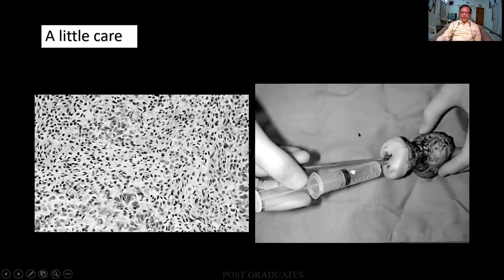Again, a wonderful one. If the surgeons and the theatre staff were taking this amount of precautions, we will not be reporting on an autolyzed endometrium or trying to compromise with the report. So obviously, you find that the external surface will be penetrated with formalin, whereas the internal surface they are injecting it so that the endometrium and the cervical mucosa will be fixed to some extent.